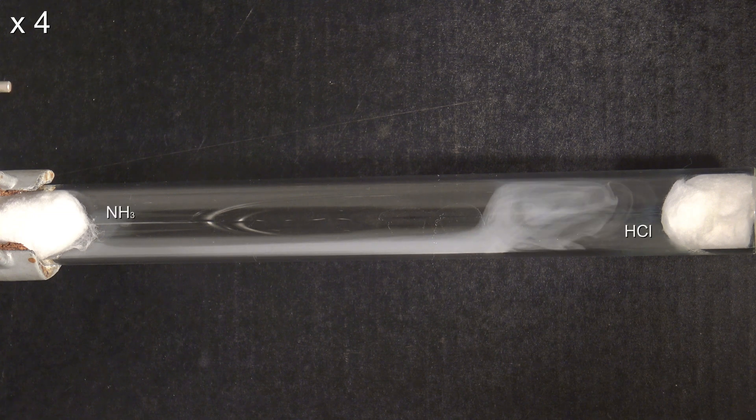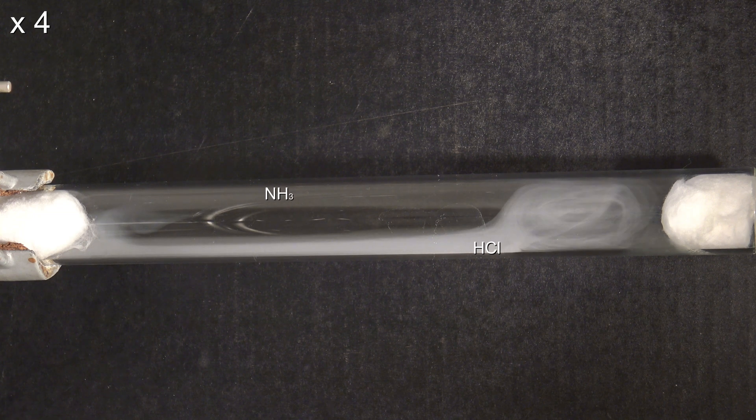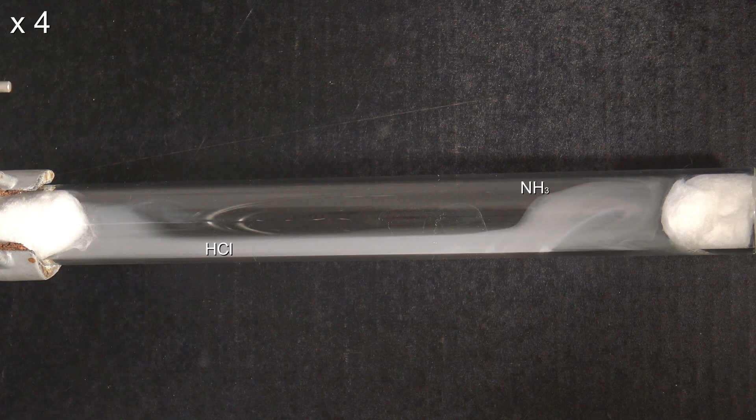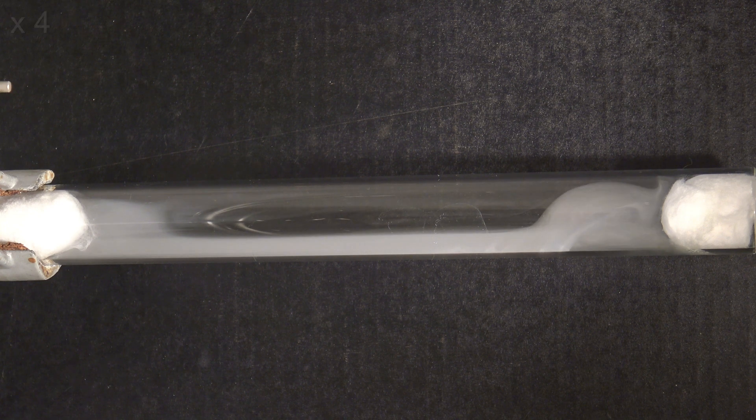The heavy hydrogen chloride drops to the bottom and moves to the left, while the less dense ammonia moves up and to the right. More ammonium chloride is formed where the gases meet.